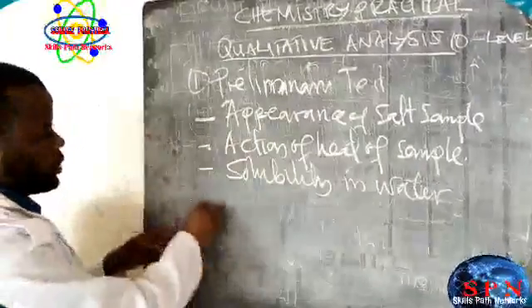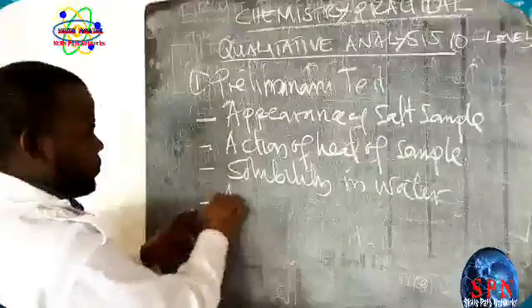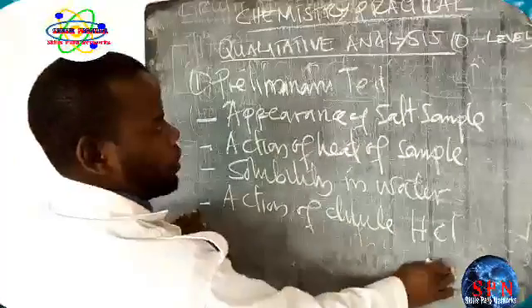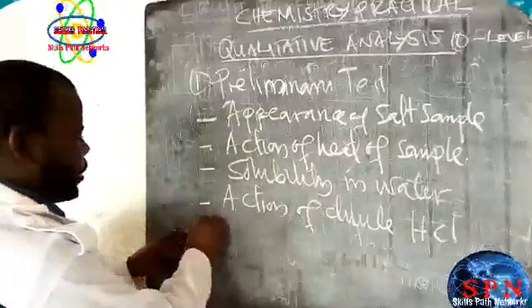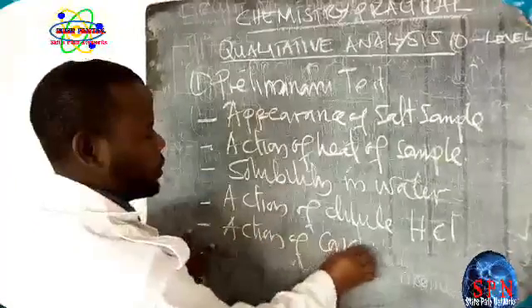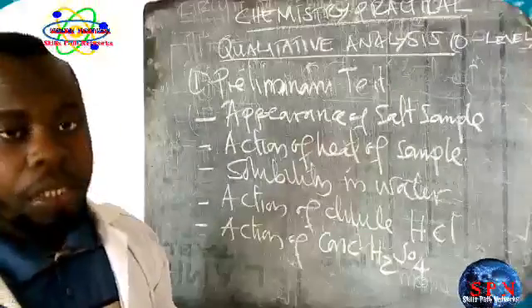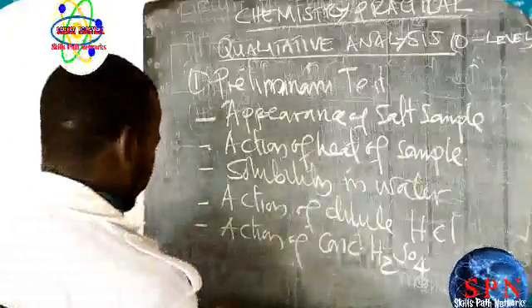Then there is the action of dilute hydrochloric acid, and the action of concentrated sulfuric acid. At the end we use the flame test.